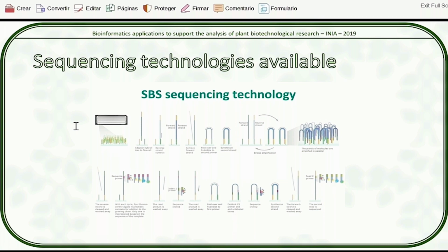Now, what's the next step? Is to convert that video of flashing colors into guesses of what has been added. If we are used to saying that red codes for adenine, then every time we see a red flash in one spot, that means that the sequence in that spot has just added an adenine. So therefore, we can add an adenine to that position.